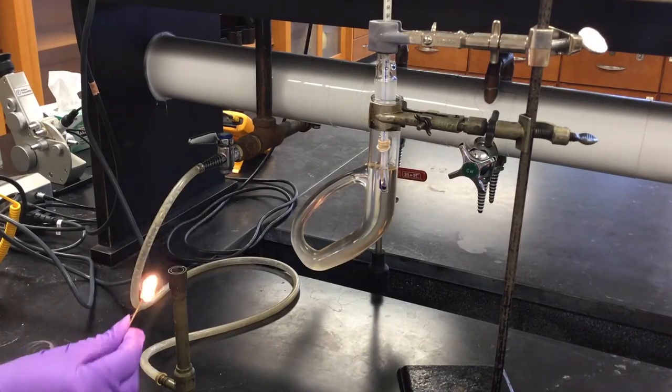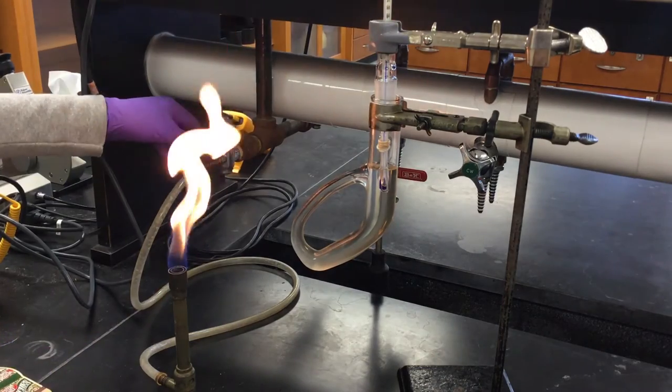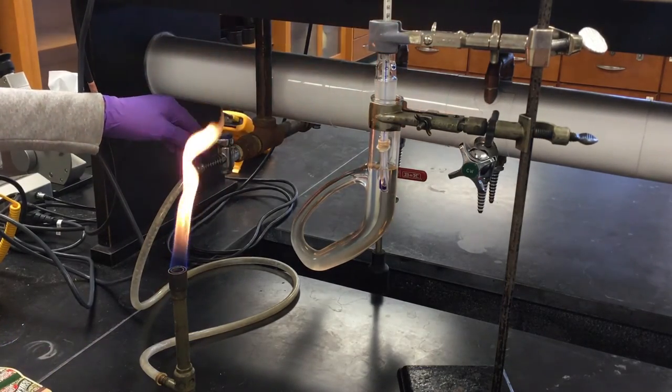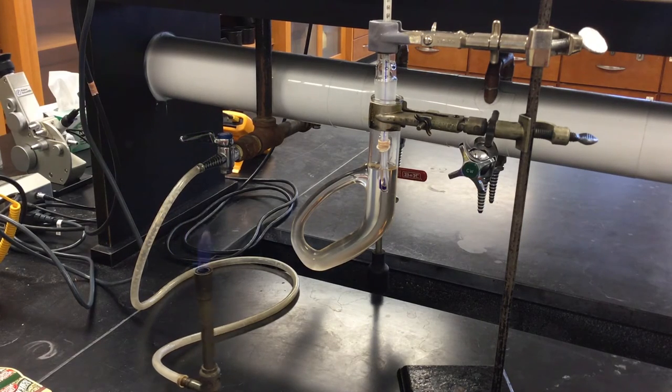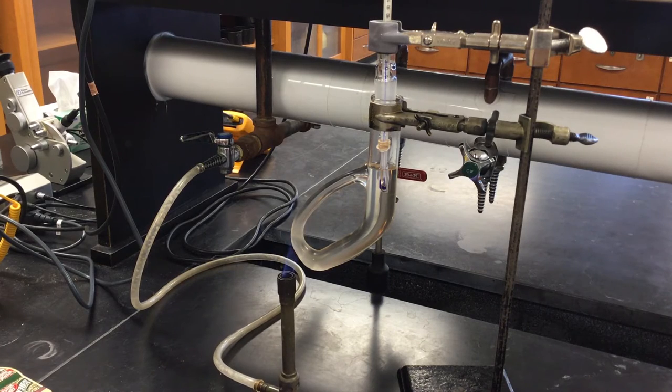Next, light the Bunsen burner and turn on the flame. You want a small blue one. Place it just to the left of the bottom to create a clockwise flow.